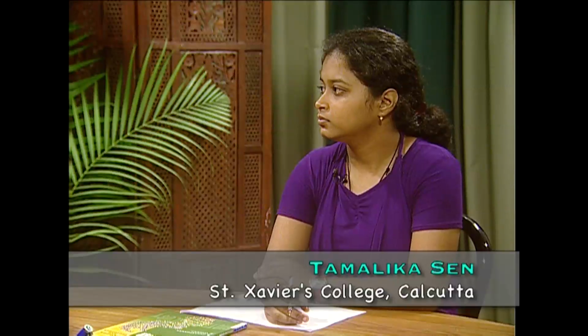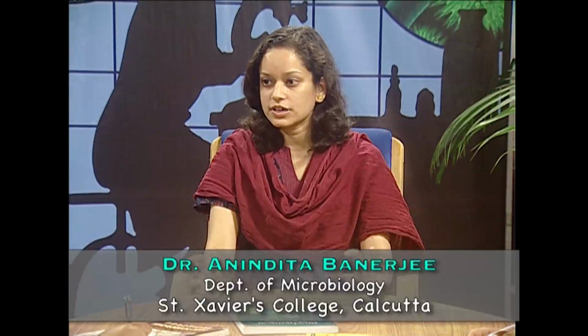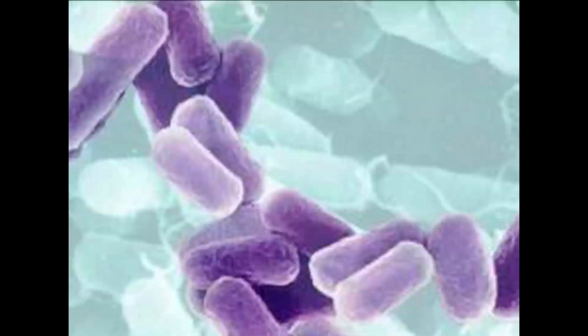Culture medium generally consists of different kinds of elements. The kind of elements added to the culture medium depends upon the kind of bacteria which we want to grow. Generally, the bacteriological culture medium is a mixture of natural and synthetic compounds mixed in a fixed ratio, which is needed for the growth and development of the bacteria under lab conditions. It's generally made up of microelements, macroelements, trace elements and vitamins.